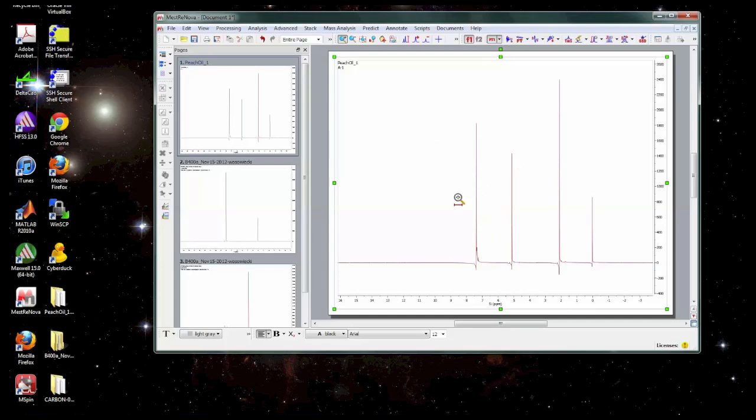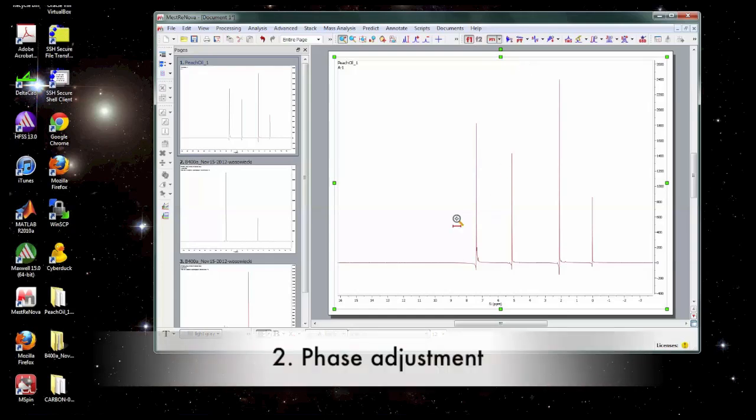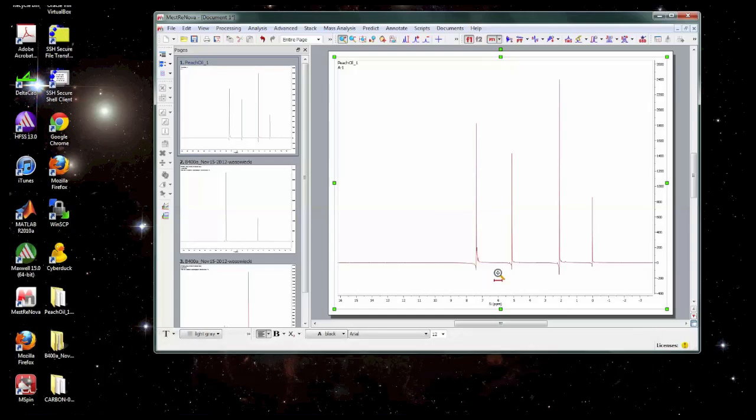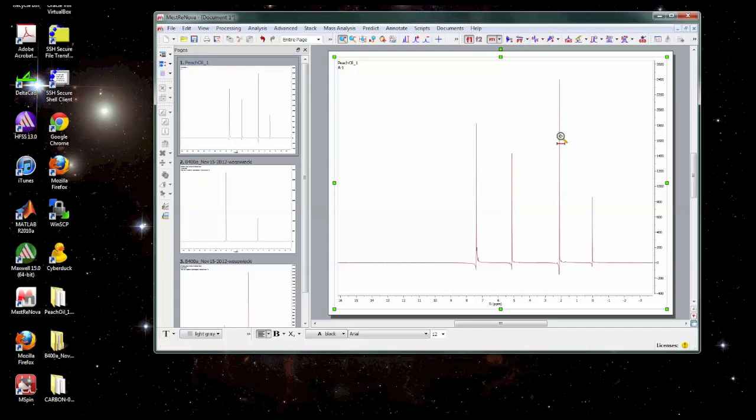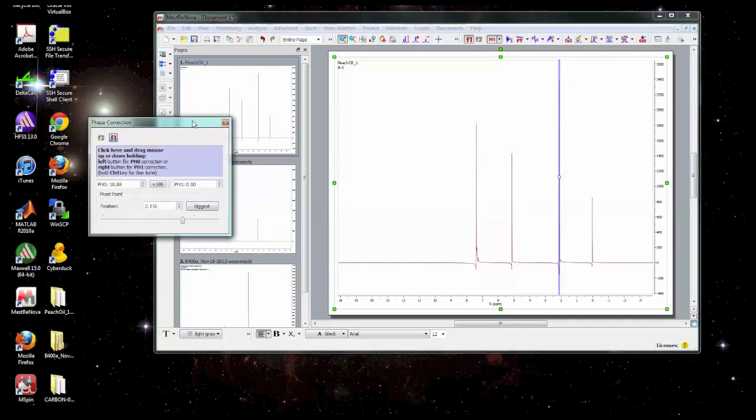Okay so we've got the Fourier transform data. Next thing we want to do is adjust the phasing if it's necessary. I can tell that this spectrum is not phased correctly because the line shapes do not look like I expect. So to do that to fix it I'm going to go to this phase correction menu and select manual correction. This window comes up and this box right here is what it's talking about for click here.